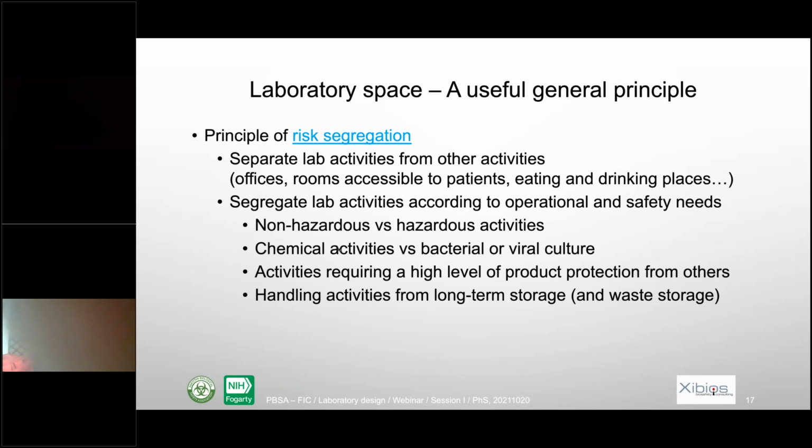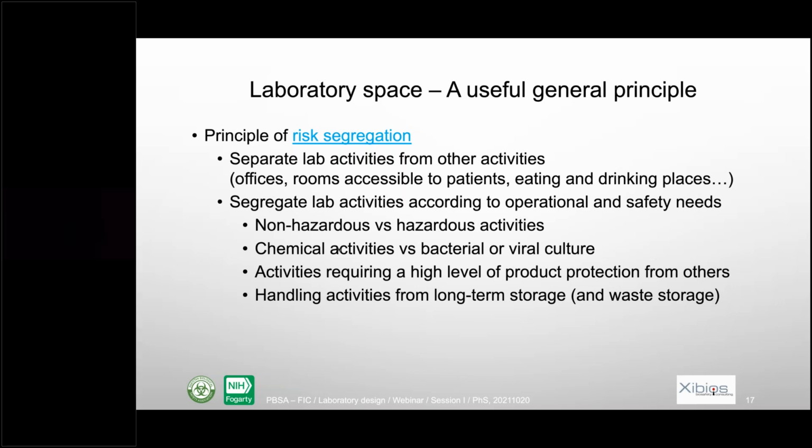Also, separate chemical activities from your bacterial or viral culture in order that chemicals do not disturb those cultures. If you have some activities that need a high level of product protection, in that case, you could also separate them further. And then also separate long-term storage from the storage in your laboratory.